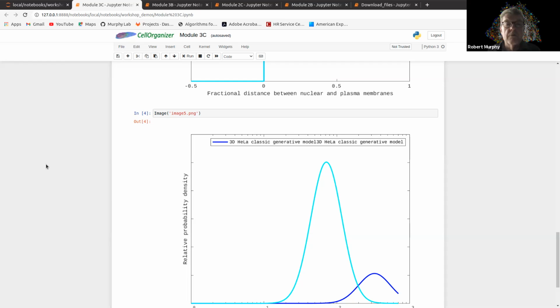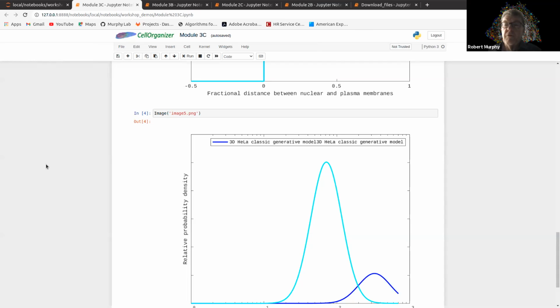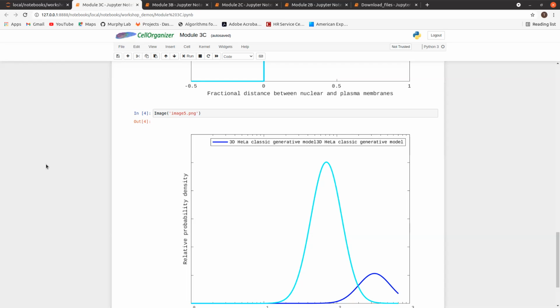If you go to that local folder, to your desktop and into that MMBIOS 2021 folder, there you should find a folder called results. Actually, for me, it's empty. Then how are you able to run your notebooks if it's empty? So maybe that's the problem. Maybe that's the reason that it takes more than 20 minutes.